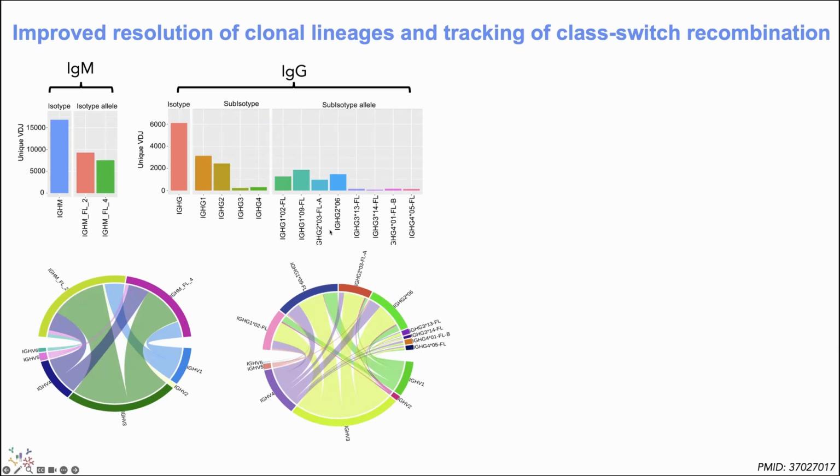And what is really powerful here about this technology, the so what of the technical trick, is that if you were specifically interested in an antibody clone in the IgG3 compartment, if you look at this bar graph here, IgG1 and IgG2 really dominate about 90% of the repertoire. And so if you're really interested in an IgG3 molecule, you're fishing through a lot of noise. You're associating clonal expansion in IgG3 with Western blots of the constant region and allotyping, and trying to extrapolate an indirect association to try to pinpoint that IgG3 specific antibody. With this method, you can analyze it and say, no, all the noise is gone. Here are my two IgG3 alleles, and these are the V genes they're using. And that allows you to really hone your investigation to specific antibodies within that compartment you know you need.